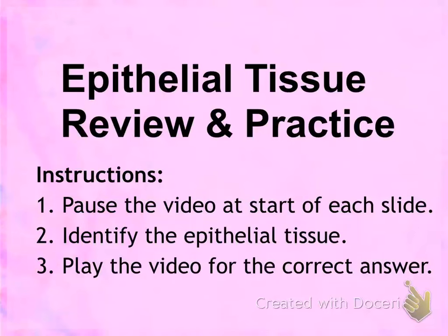This is epithelial tissue review and practice. The instruction for this video is for you to pause at each start of each slide, then try to identify the epithelial tissue and the structures within it, and then play the video to check your answers.